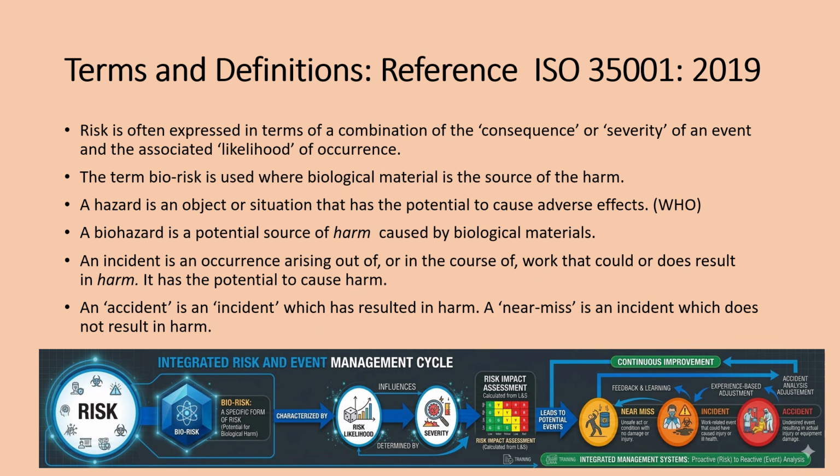Before we take a plunge into the details, let's put some terms and definitions in their proper perspective. Some terms and definitions as per ISO 35001-2019. Risk is often expressed in terms of a combination of the consequences or severity of an event and the associated likelihood of occurrence.